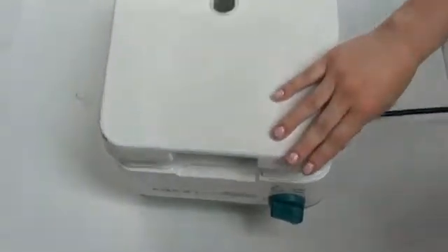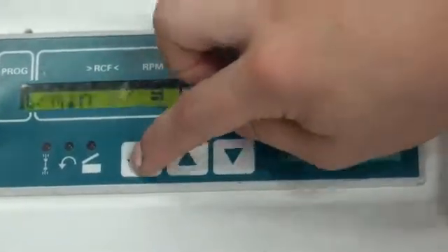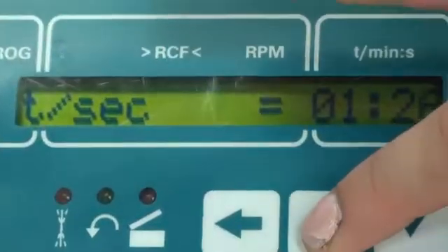One feature that's really nice about the centrifuge is that it's programmable. I'm going to go ahead and show you some of the features available on this model. You can do per minute, per second — you decide the timing. You can go up or down using these buttons.